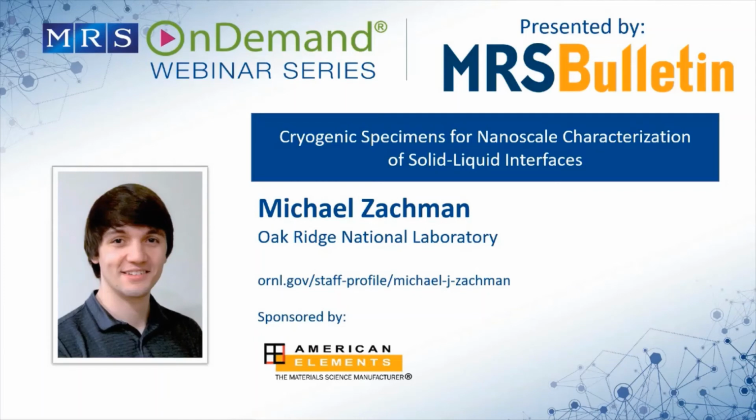And then I didn't show much of it in my talk, but the other side of this that we found from a practical perspective, working with the battery folks, they were really, really often interested in using the FIB itself to mill in and to look at interfaces within the devices that they were making. And in that case, I think a plasma FIB actually has some pretty big advantages because you can mill much larger regions much quicker. And so I think maybe on that side, it's even more useful eventually.